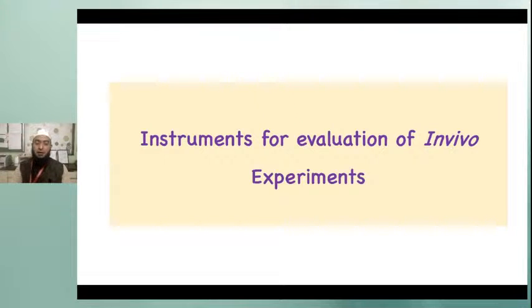Okay. Now onward, in my session, you will see the name of the instrument and you need to remember their application and the type of drug that can be evaluated by that instrument. I'm not going into detail of the principle of that experiment. The detailed working principle of that particular instrument, you will study when you study that individual experiment. So don't worry that I am not going into detail of the principle, because there are separate experiments where you are going to study the detailed principle.